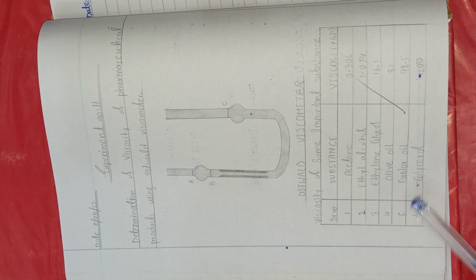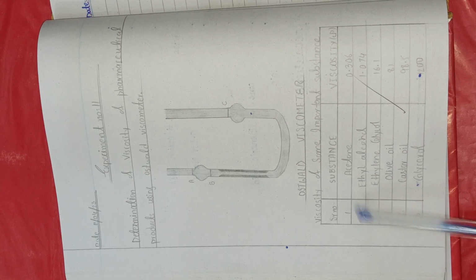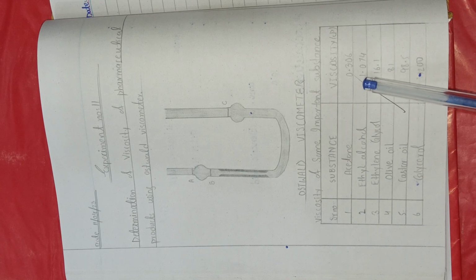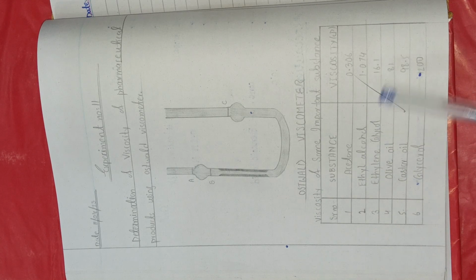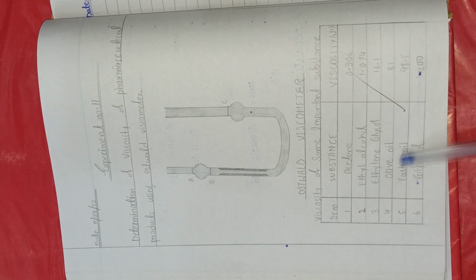So here is the important table in which some substances and their viscosities are given. For example, acetone viscosity is 0.306, and the viscosity of ethyl alcohol is 1.074. Viscosity of ethylene glycol is 16.1. Olive oil is 81. Castor oil is 98.5, and glycerol is 1200. So these are some viscosities which are given to you. Now we move on to the next page.